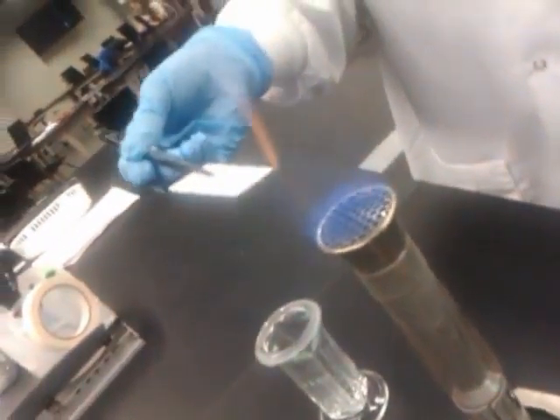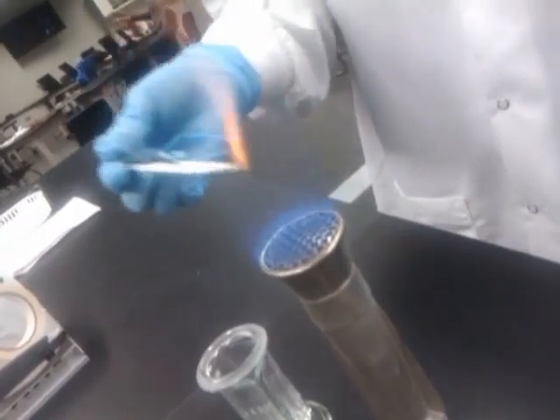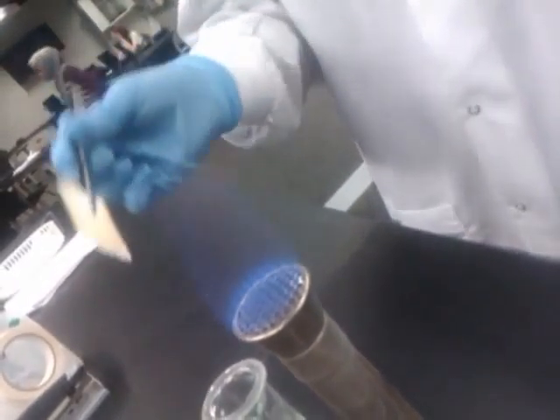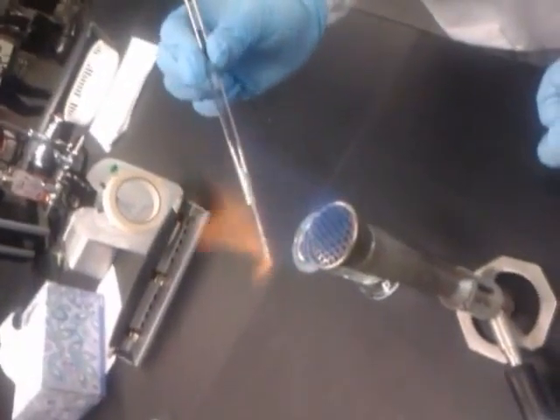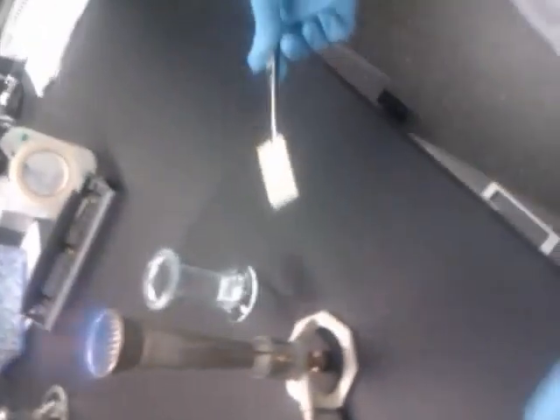To burn it, hold it over the flame and just move it back and forth. It's probably going to light on fire — that's alright. Make sure you get an even burn. Now that it's burned enough, watch out, set it down. And you can see the spots now.